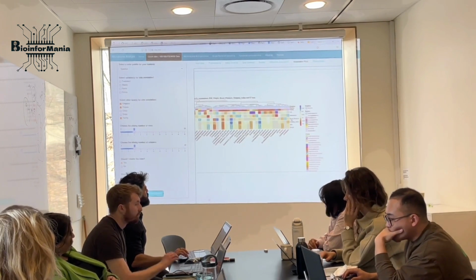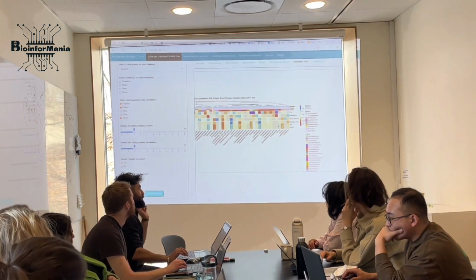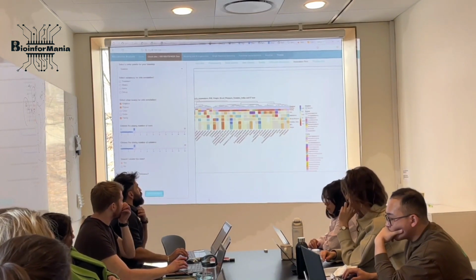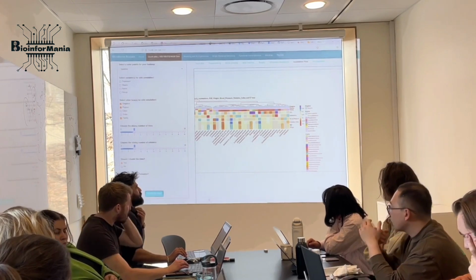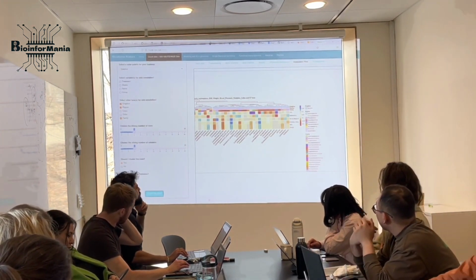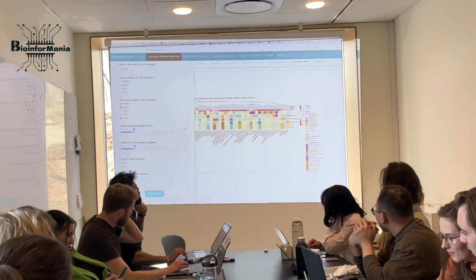You see here this cut: diabetes index, body mass index, and weight. Although it's not significant, otherwise you would have a star sign on it, they have actually been clustered together, and that's cool. You see, short-chain fatty acid doesn't have anything to do with this. And you can also see this clustering of the different taxa up there, belonging to phylum, kingdom, phylum, family.